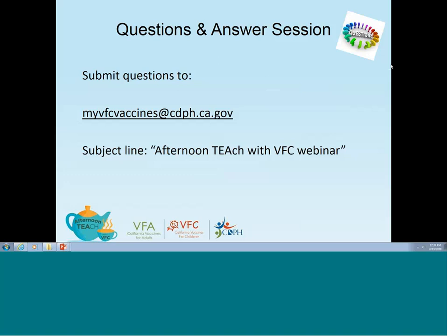Another question, where can we see the battery indicator? Well, hopefully you will see it on your digital display on your data logger. I don't know exactly where it'll be because I don't know what model you have, but I've been finding the battery indicator typically in the top left or top right corner of the device. But again, there are hundreds of data loggers out there, and I'm not familiar with every single one of them. So you might want to go back and look at your manufacturer's handbook, and they may be able to give you some more information.